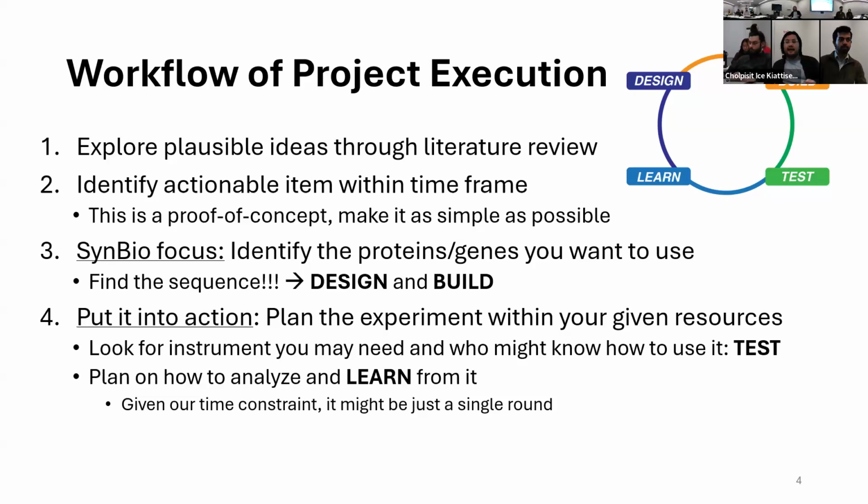So if you're ordering any DNA, keep in mind that you may only have time for yourself and for the company to synthesize that for you, just one round. And by one round, it works out to about one week of very heavy full lab work. For example, in the Anderson assembly lab, you might be doing a project of similar scope over the course of one week. So try to order as much as you can and plan ahead of time, but just know that the timeline is going to be one week for this kind of proof of concept. Generally that's how this goes.